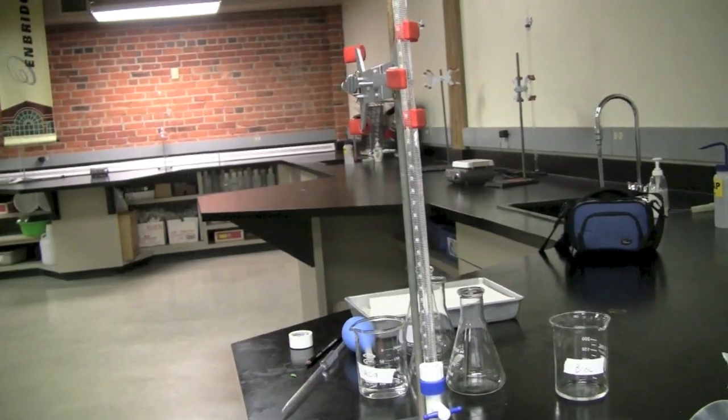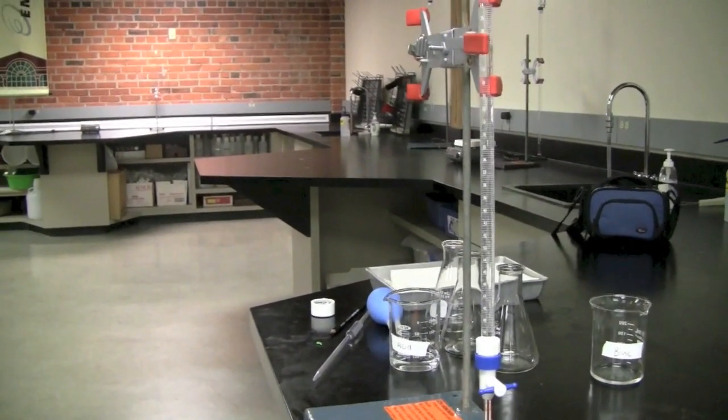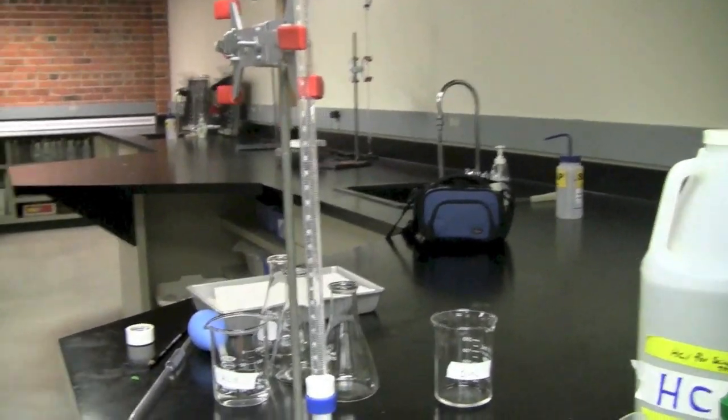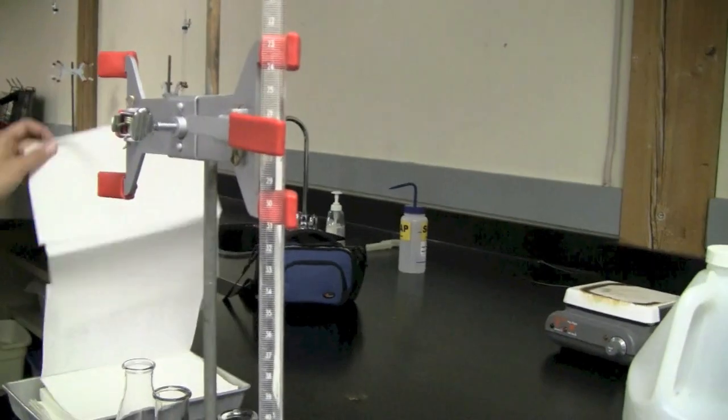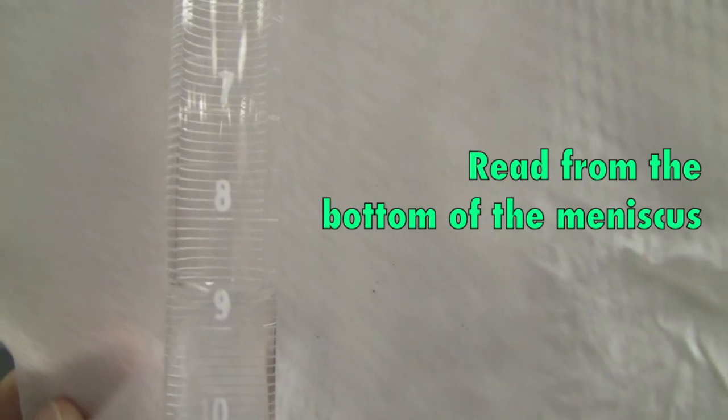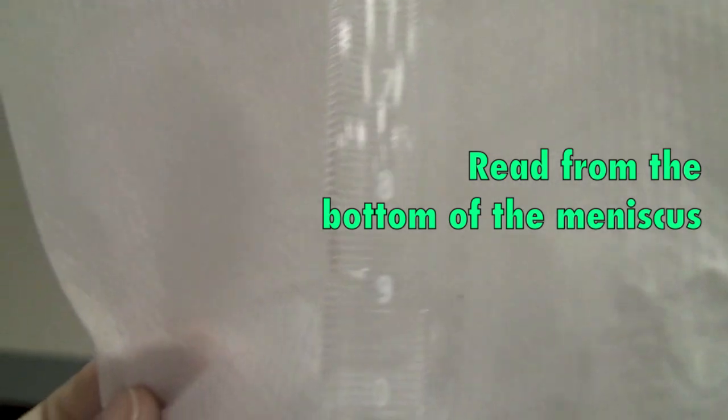So of course, it's very important to read and record the initial volume of the solution. What you're going to do is you're going to grab a paper towel and you're going to put it behind the burette. So remember, you're trying to read from the bottom of the meniscus. Let's take a look out here.